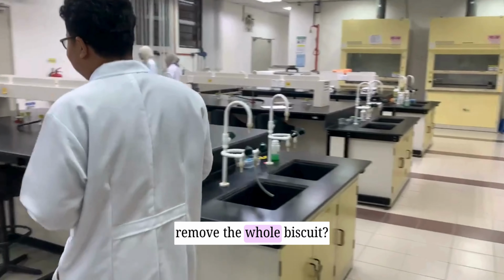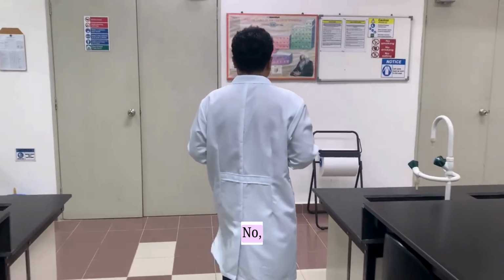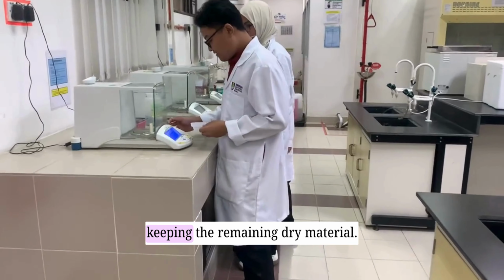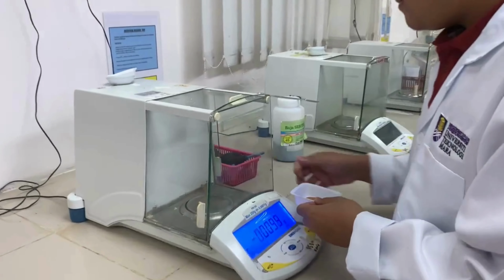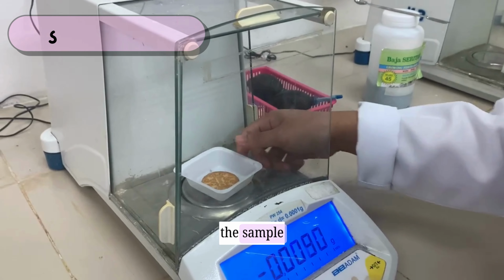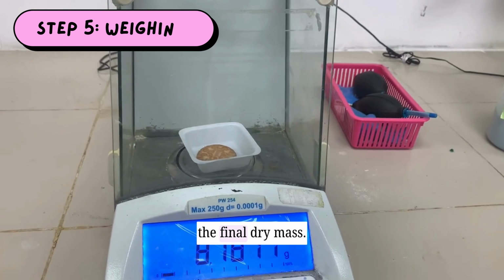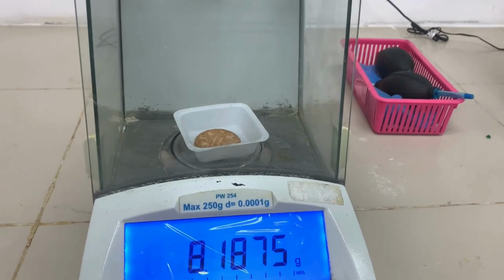Does the heating remove the whole biscuit? No, the purpose is only to remove the water content while keeping the remaining dry material. After drying, the sample is cooled and weighed again to obtain the final dry mass.